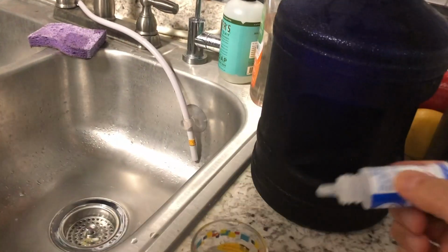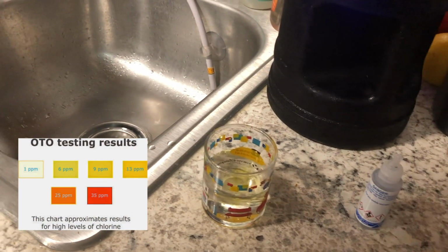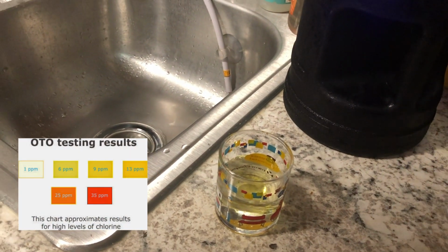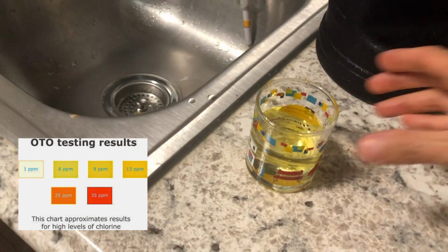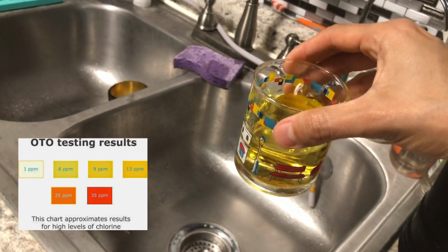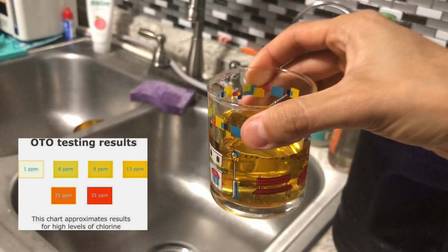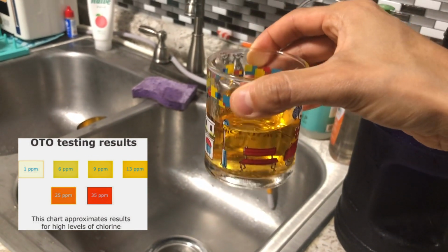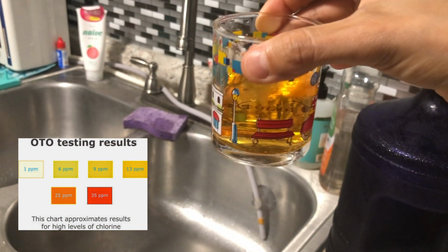Now we'll see what happens. What do we get? 1, 2, 3. Oh, it turns yellow. My guess was right. So just because you didn't get a reading at the first draw of the water doesn't mean that you don't have chlorine. It gets darker and darker. So this, at the pool, if it reads this, is highly toxic.